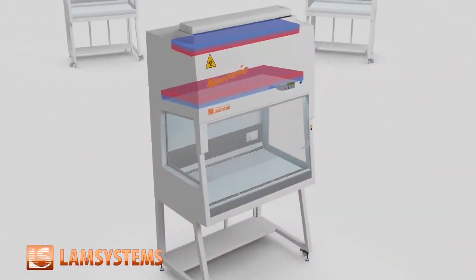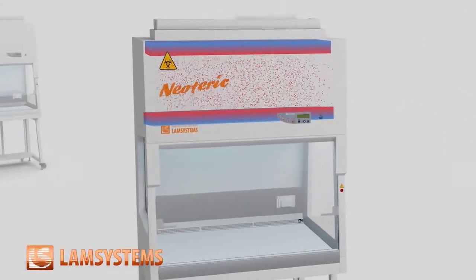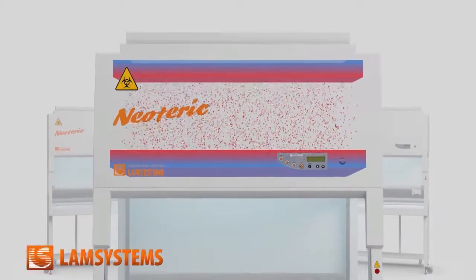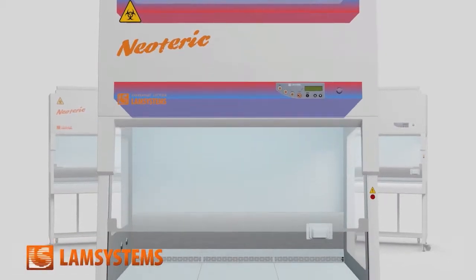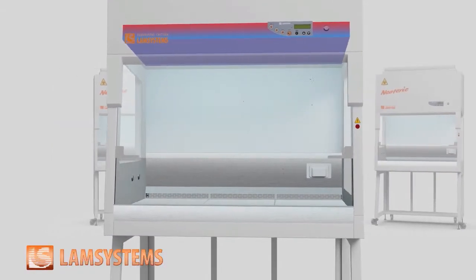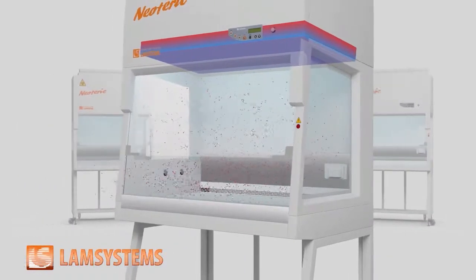HEPA filters installed in the cabinet effectively retain mechanical particles with pathogens deposited on them, preventing their release into the environment. But you cannot use filters everywhere. For example, you cannot use a filter in the front cabinet opening, as it is through it that the personnel provide working inside the cabinet, and it is the place where hazardous pathogens, if they appear in the working chamber, can leak into the environment.